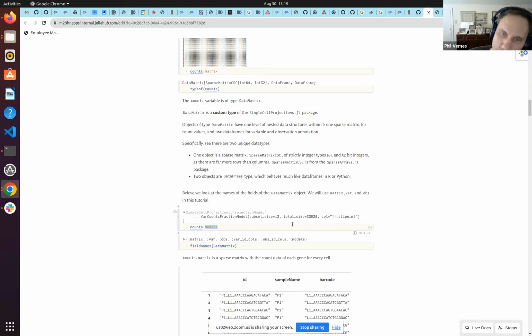The whole point of this models thing is that as we go down the mRNA sequencing process, as the users here are probably familiar, there are things you do. There are transformations, normalizations. Well, actually, let's do it in order, right? Filtering, normalizations, transformations, or maybe it's backwards. But anyway, you do things. You mutate your data, and you want to make sure that you're capturing that. You don't want to be losing that state of how did I make this?